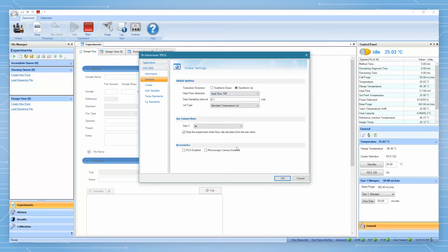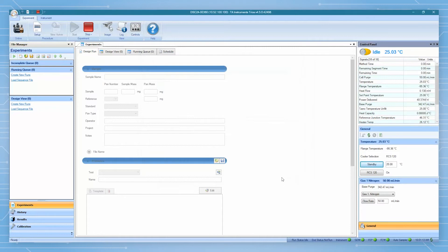Once the PCA is enabled via TRIO, the autosampler, if present, will be disabled. After that, we are ready to install the PCA.